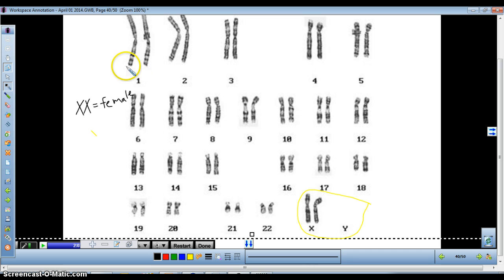Does this person have two sets of chromosomes? Yep, so everything's okay. 23 pairs of chromosomes means human.